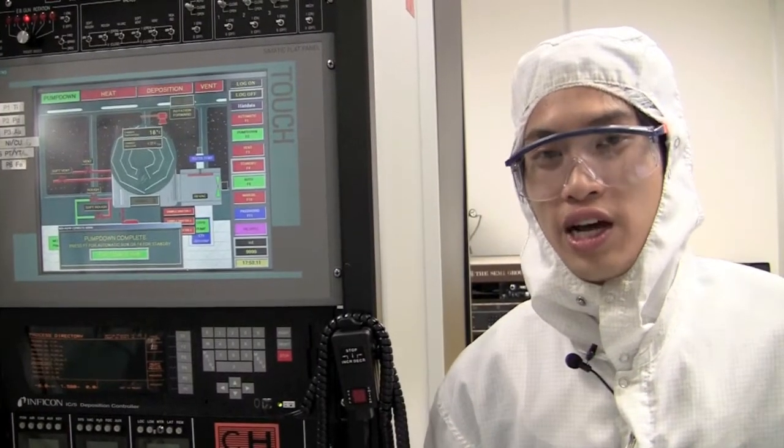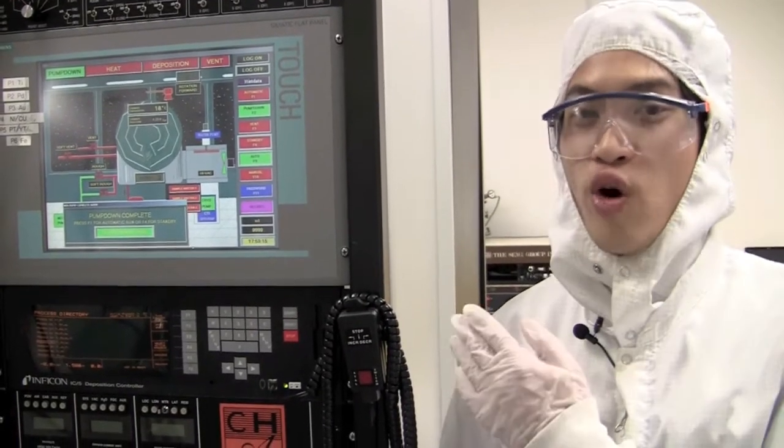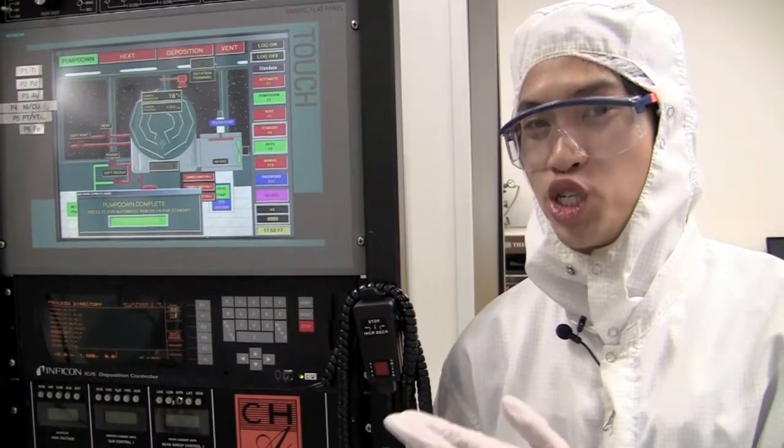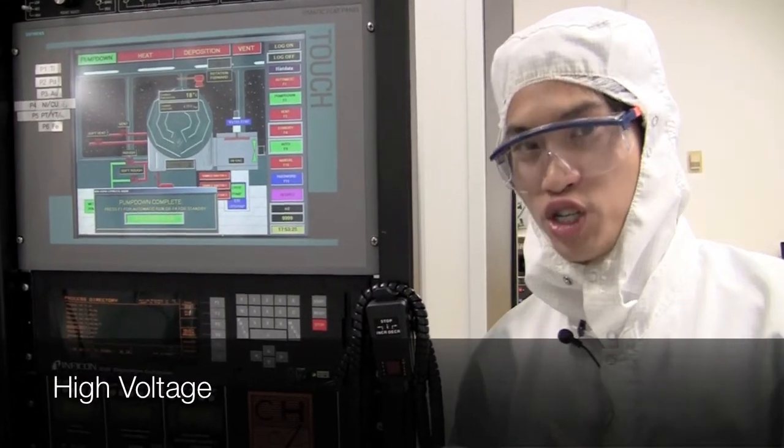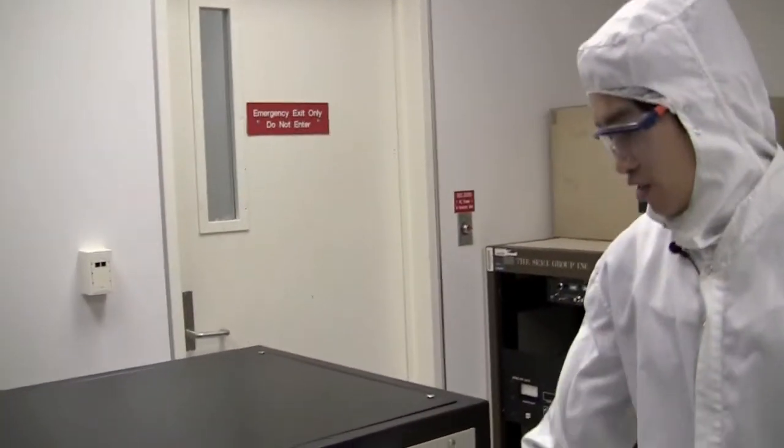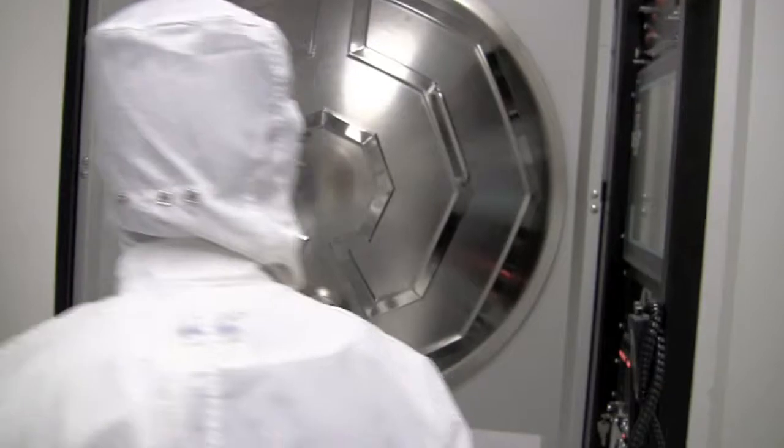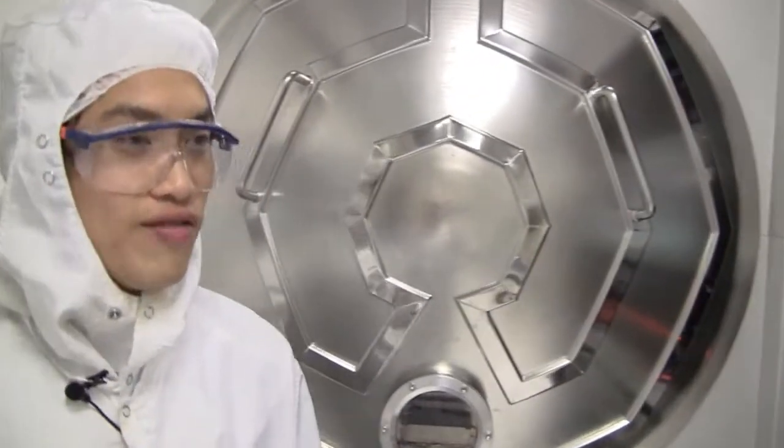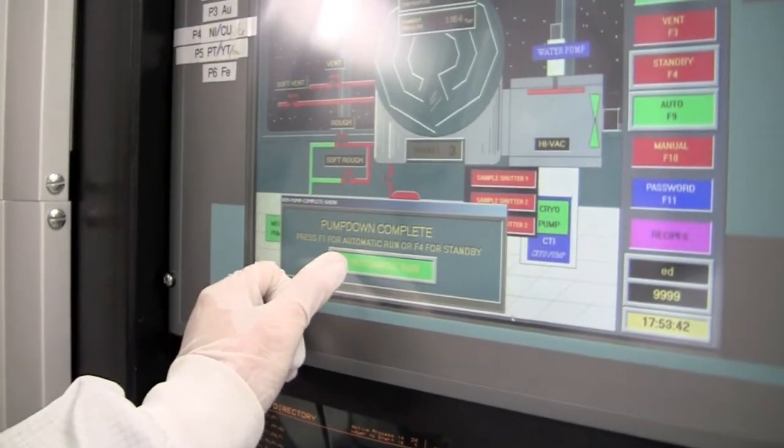Once the tool has reached the set point of 5 times 10 to the minus 6, we can go ahead and tell the tool to begin the deposition process. But in order to do so, we need to make sure that the high voltage source is on. To do that, we're going to go around to the side here and simply flip this switch on here. That makes sure that the high voltage is on. Once the high voltage is on, we can go ahead and push F1 to do an automatic run.